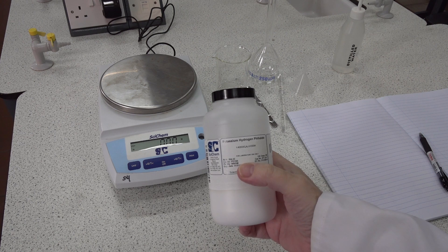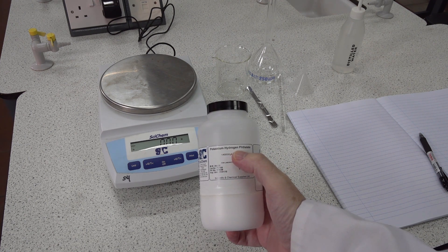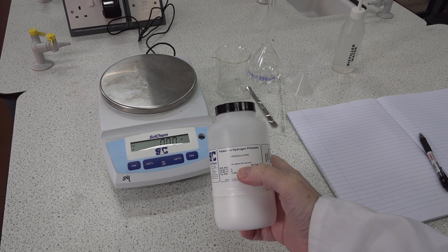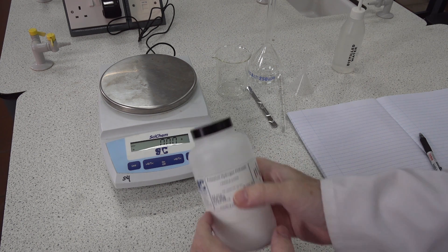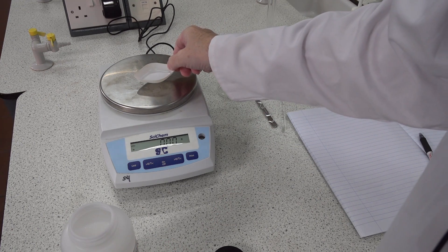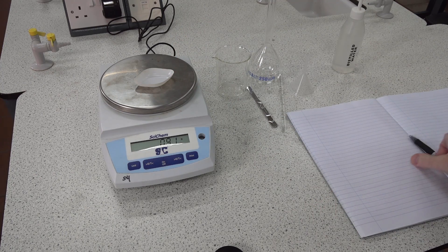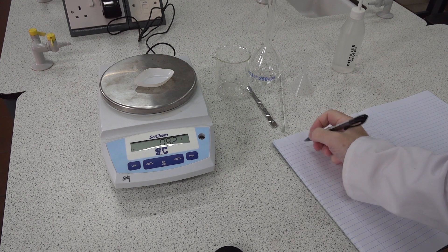In the classic ILPAC experiment, preparing a standard solution of potassium hydrogen phthalate, students were asked to weigh out between 4.8 and 5.4 grams of potassium hydrogen phthalate. They might do so into a weighing boat such as this and record their results in their laboratory book.